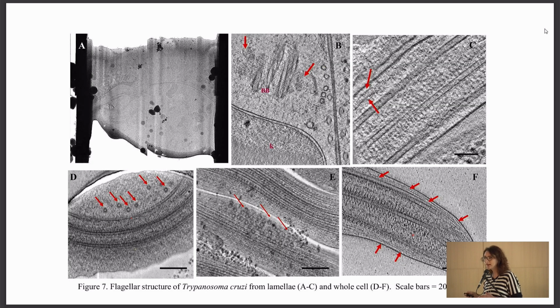When we look directly at the flagellum, because the flagellum is thin enough to be directly observed under the microscope, we could see novel circular structures in the Trypanosoma cruzi flagellum, also located between the flagellar membrane and the axoneme. Those are organized as a few structures pulled together, or as many circular structures forming a big group, forming some kind of protrusions in the membrane of the flagellum.